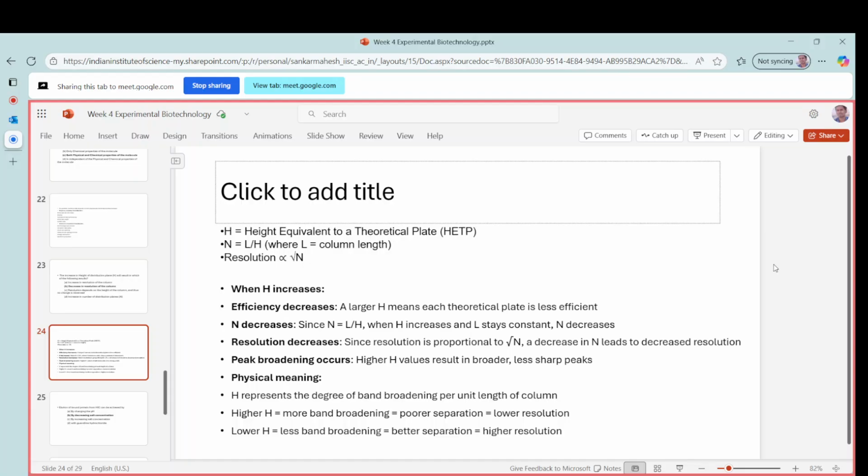You have a protein of interest that is passing through a very long column. Now, because its distance is high, the number of theoretical plates is also high. And because the number of theoretical plates is high, it has multiple rounds of selection. That is one way you can think of this. Or you can say that it goes through multiple beads. So it is slow, and because these proteins are all of the same size of that species, all these proteins of the same species go through the same path multiple times, and then they elute. So it is of higher resolution.